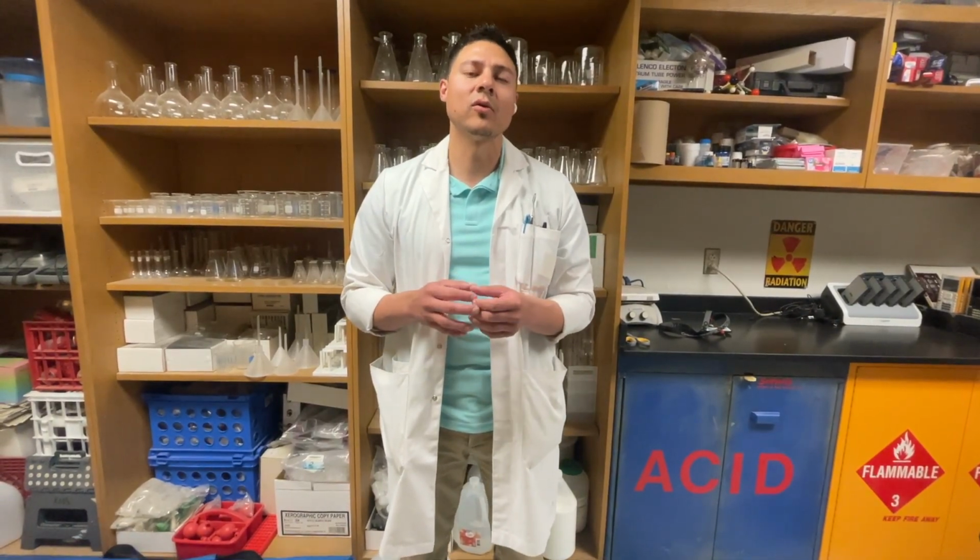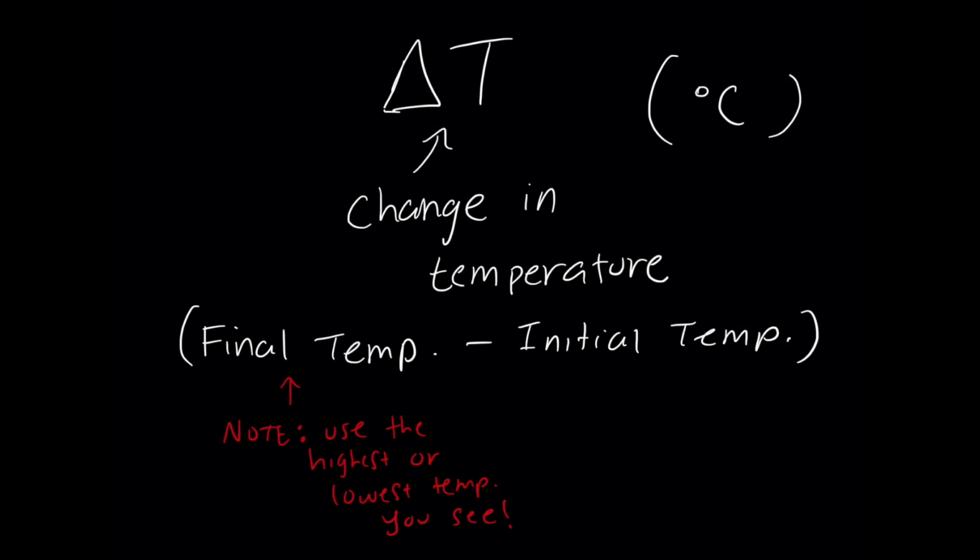So this is also known as a calorimeter. It has that word calor, or heat, and we're measuring the heat changes inside this chamber or this isolated system so that we can determine if we have an exothermic or endothermic process.